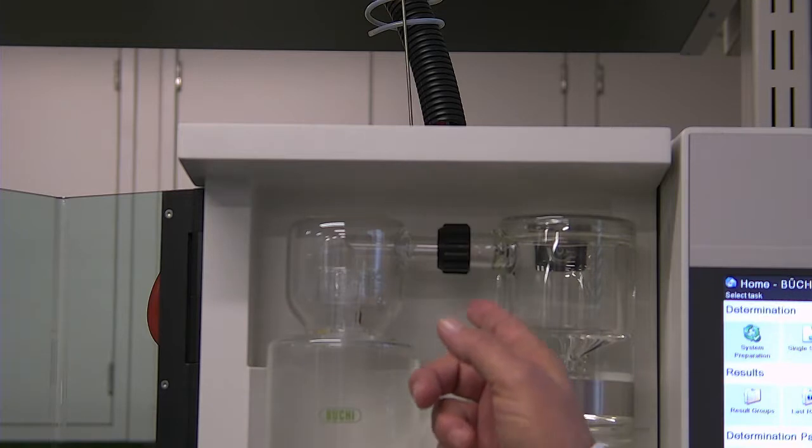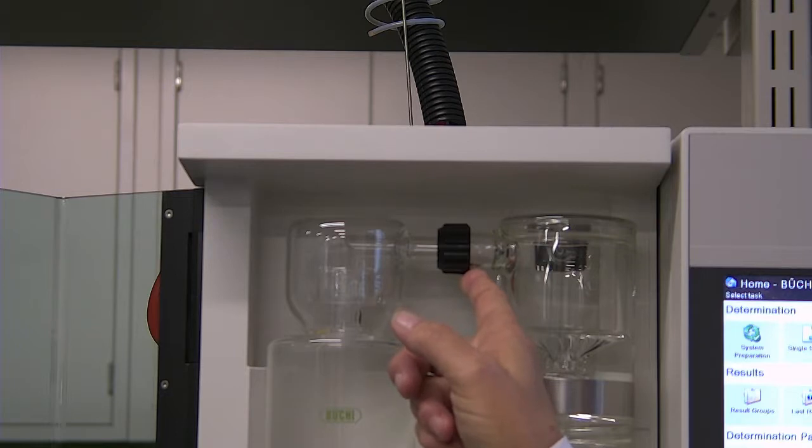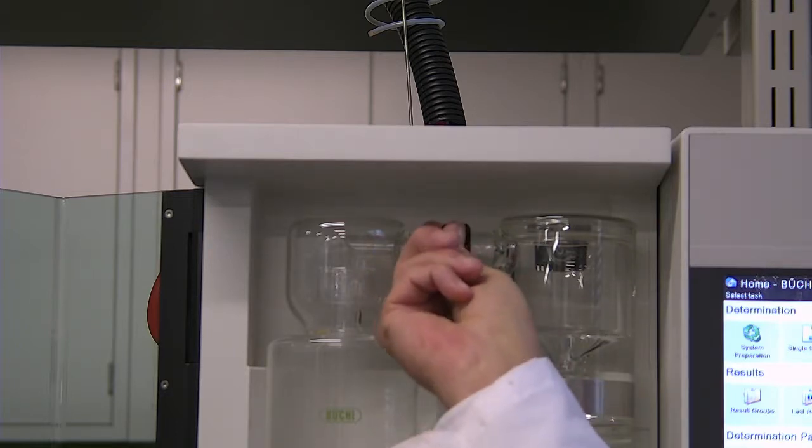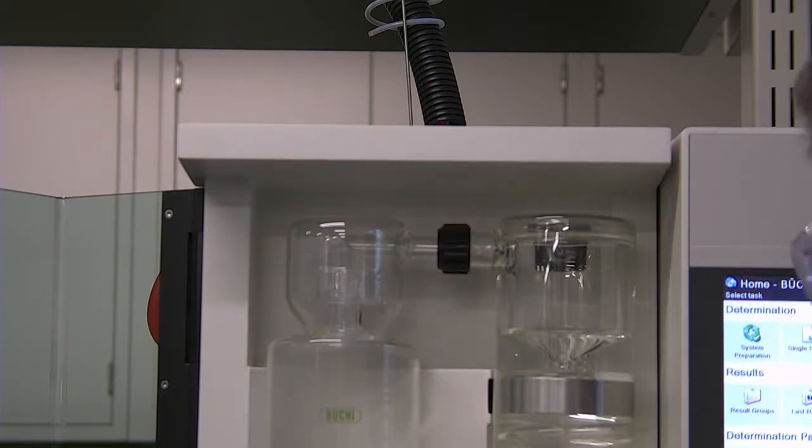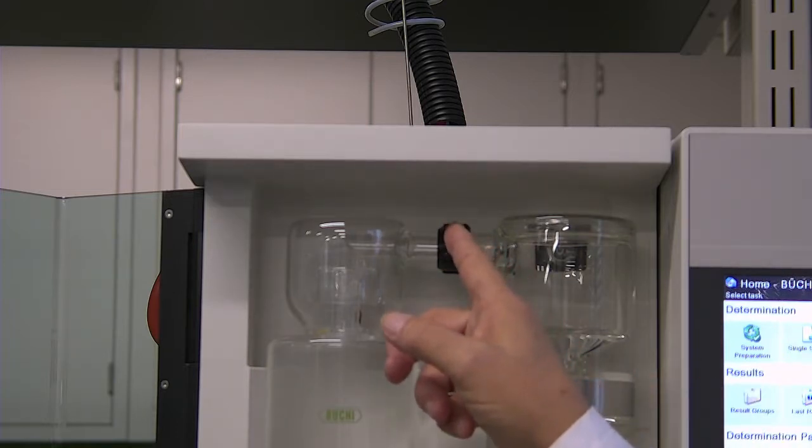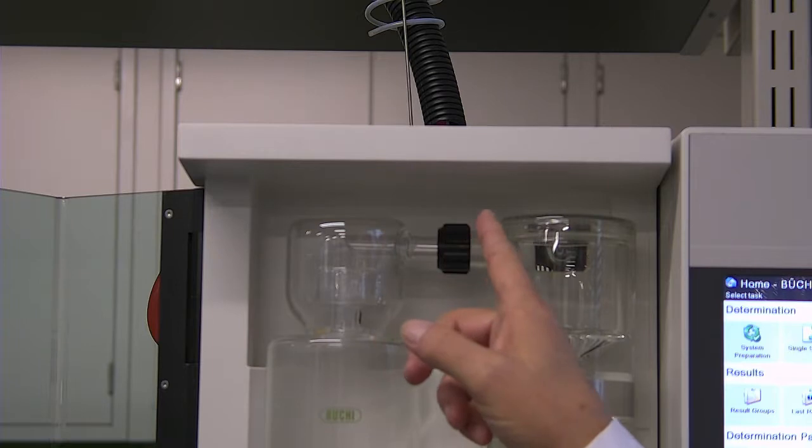If you see any drips coming off of here, you are losing nitrogen right there. Make sure that is always tight. Do not use pliers, that will only result in breaking the plastic nut or the glass.